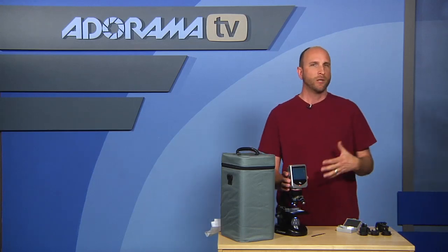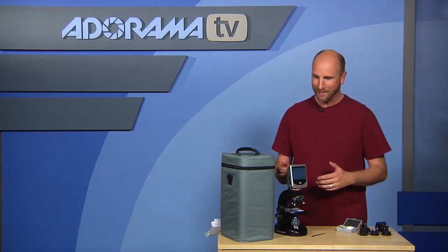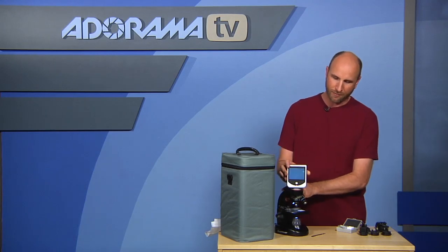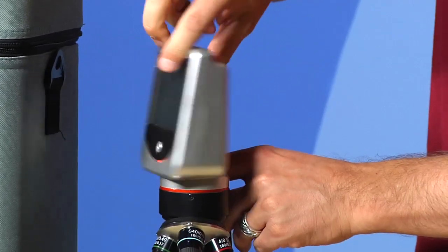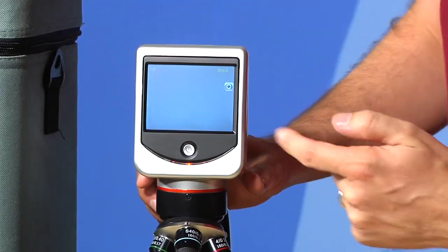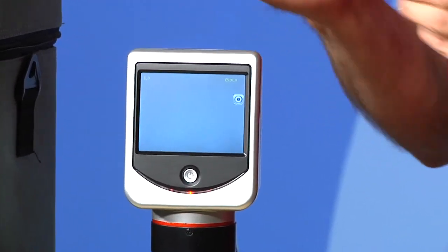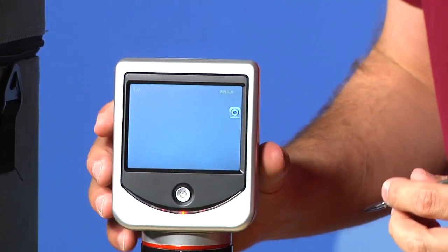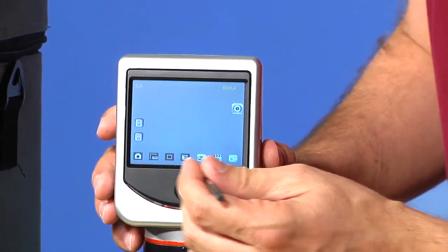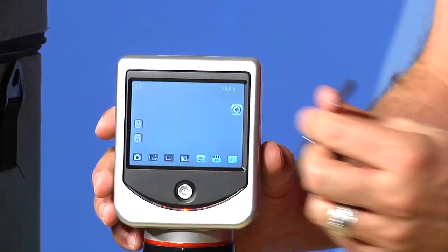The thing I love about this — I've been playing with it quite a bit, probably too much because it's pretty fascinating. It has all kinds of neat stuff, so let me start by talking about this top screen here. It's a swivel screen that rotates 180 degrees, and it's a three and a half inch touch screen, so it comes with a stylus. This works like an older Windows CE device — you can touch the screen with the stylus and based on where you touch, you get different options, so you can control the whole microscope right from the touch screen.